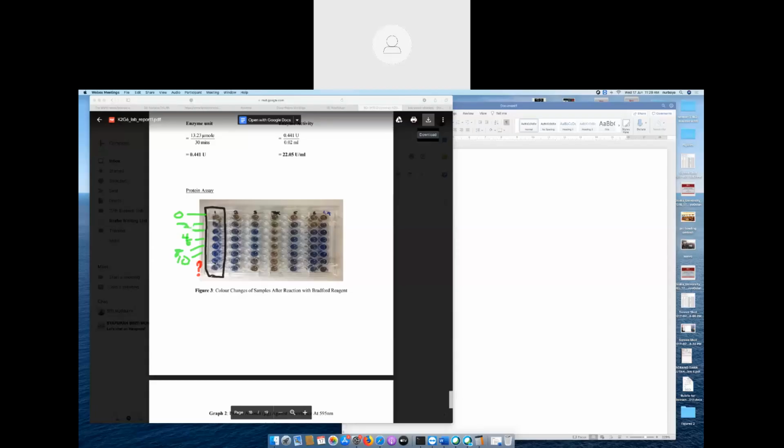Okay, if you put 20 microliter here, maybe the absorbance here is more than the 10 here. I mean 10 microgram. Okay, I repeat. Why do you put here 20 microgram? And here why do you put 10 microgram? Because the maximum volume will be 10 for the sample.